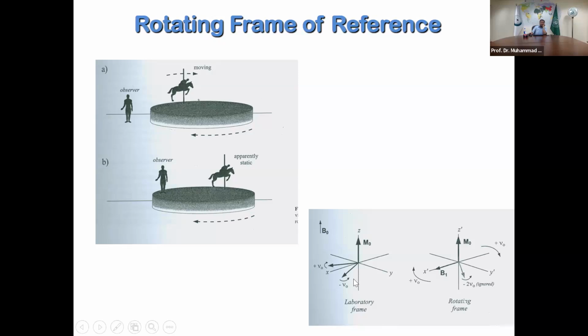These two are moving with the speed of light, and you don't even know where they actually are. So you can't do anything with them. You will not be able to selectively decouple or move them in a particular direction if you don't know where they actually are.